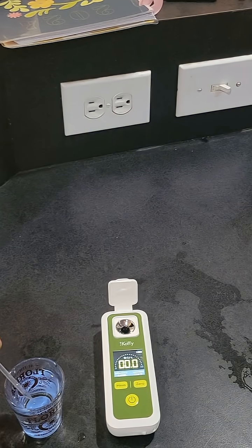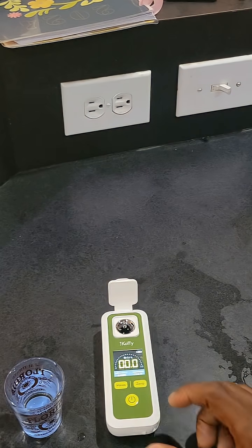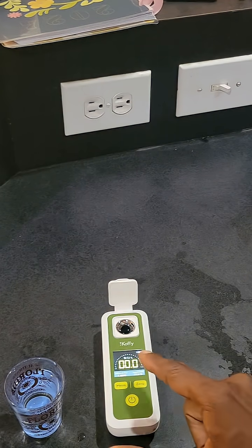Step three: place some clean water inside the tester. Step four: press zero to zero everything out. It's at zero.